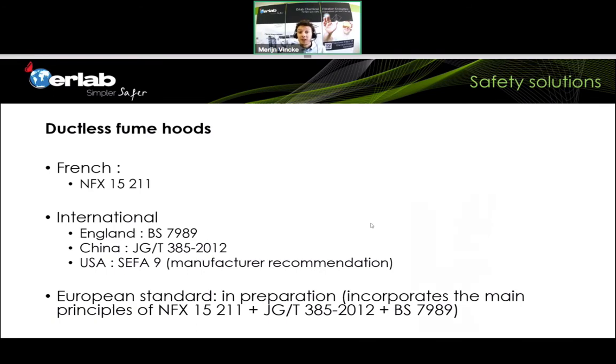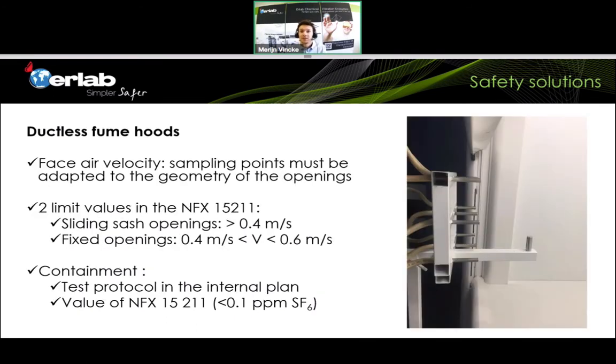Again, if we talk about containment, because that's what this is all about. It's about minimizing the risk. So this air barrier that you have between the chemical products and the person in the lab must be tested as well on a ductless fume hood. So how do we do that? We apply exactly the same protocol that is performed on the ducted fume hoods, which is part 3 of the EN 14175.